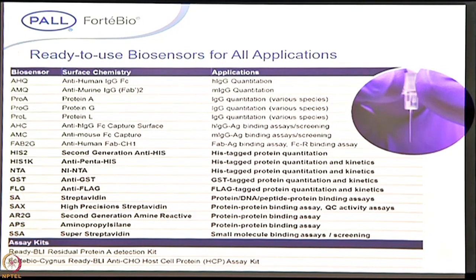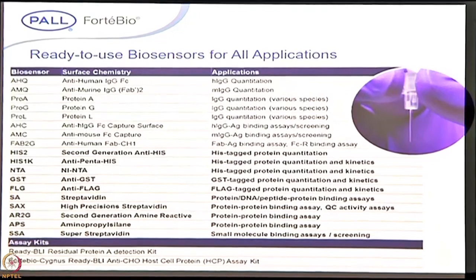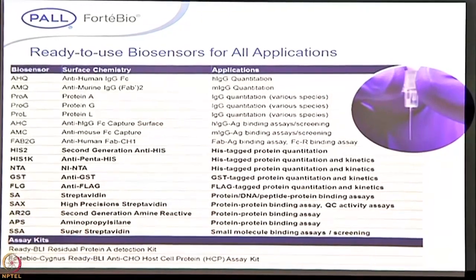We have APS sensors, aminopropylsilane, for hydrophobic interaction. If your protein is more hydrophobic, there's no need for any tag or anything, you can bind the protein of interest on that. And for the super streptavidin, this is a quartz-based sensor, especially for small molecule protein interactions.